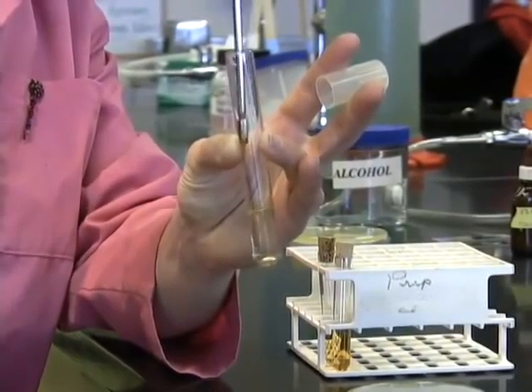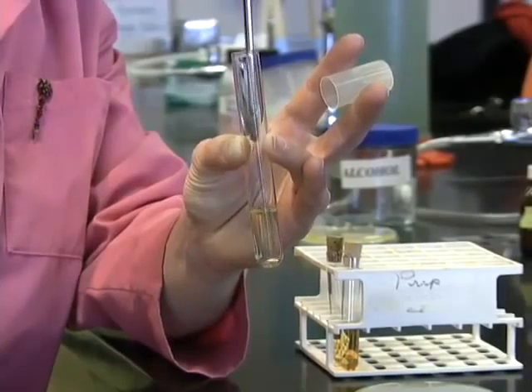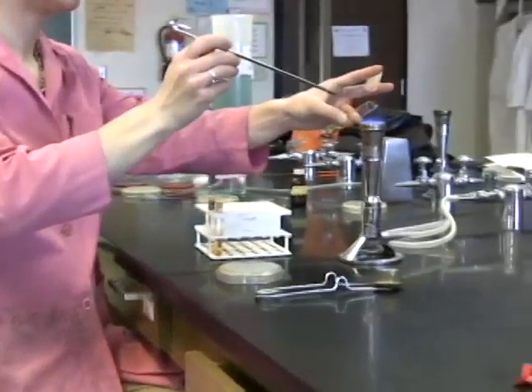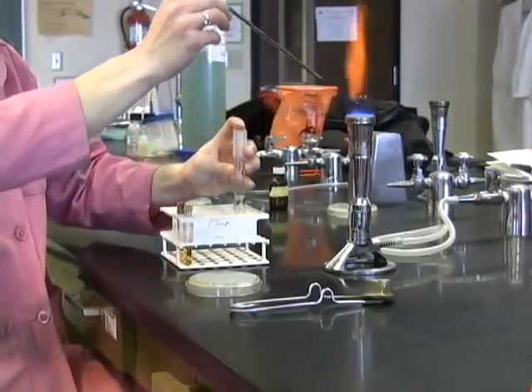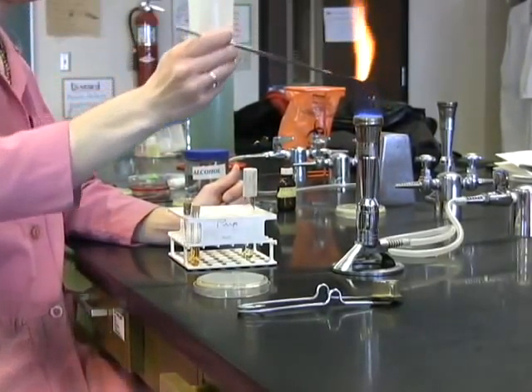You'll use this same procedure for any tube of broth that you're inoculating, whether it be a TSB tube, such as shown here, or a urea tube, such as shown in the rack there. Any small tube of broth or larger tube of broth would be inoculated in the exact same way.